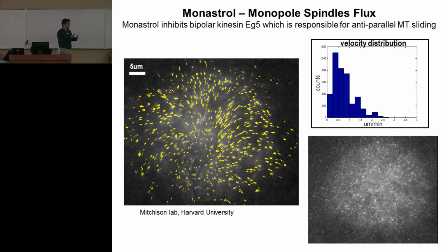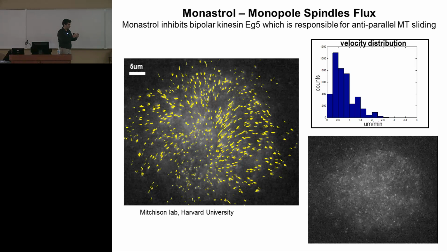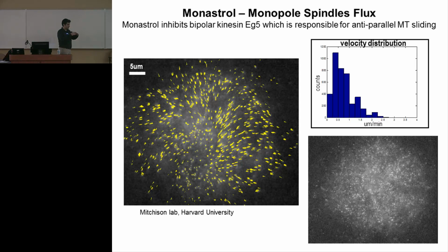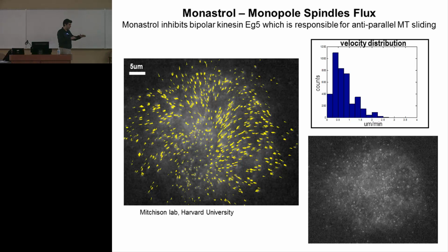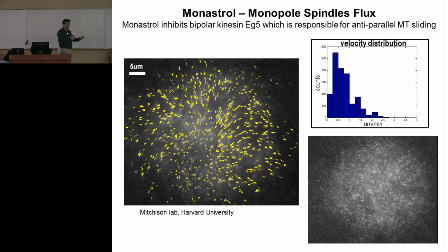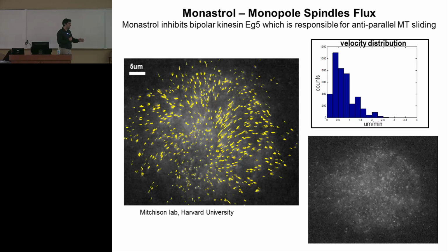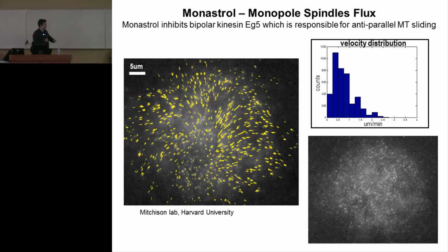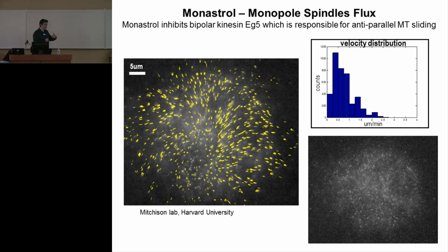With narrow Gaussian filtering, we get the high frequency noise of the background out, and with the Gaussian with wide variance, we get the overall background fluorescence out. After subtraction of the 2, we have a bandpass filter. All of them pop up. So detection is not that hard. But the problem is that the features are not stable, so they appear and disappear. You don't know, there is no constant number of them.